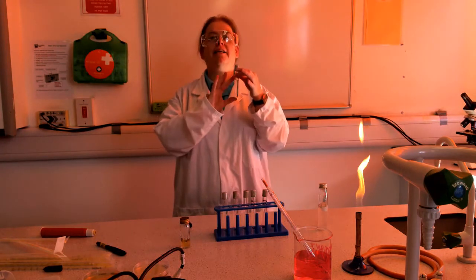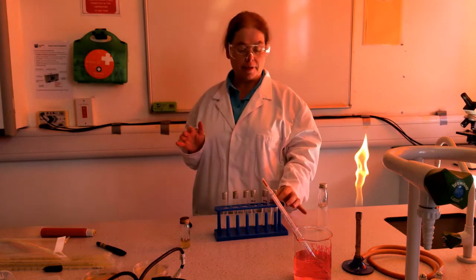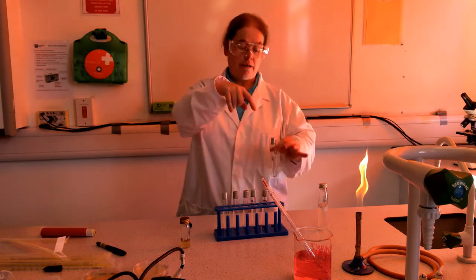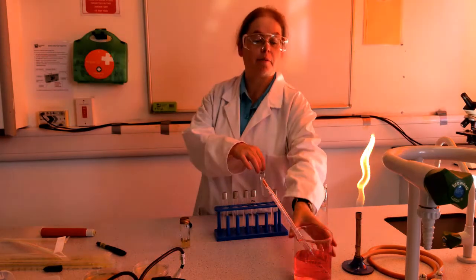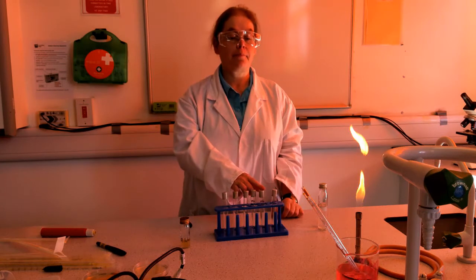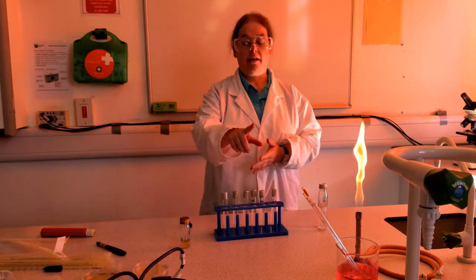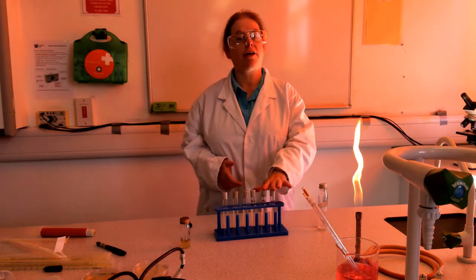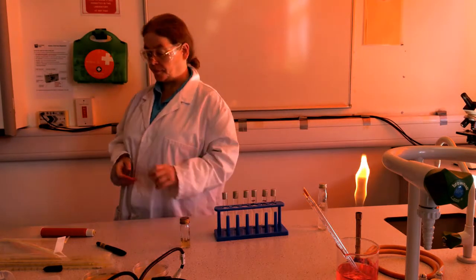So I'll have 10 millilitres in here, and I will have diluted the bacteria 100 times. Then I'm going to take 0.1 millilitres out of this tube and put it in this tube. This one is behind the pipette, isn't it? It would be. Right, in this tube. And then I'm going to take 0.1 out of there and put it in here. So I'll have a 100 times dilution, a 10,000 times dilution, and a 1 million times dilution.